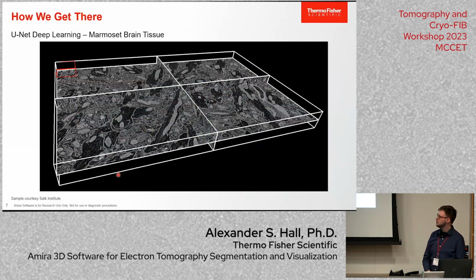So the traditional methods of thresholding or isolating the phases according to their intensity range, that wouldn't really capture much of anything here. And Cryo-ET data is very, very similar. So where the field is moving right now and where Amira is going is to lean heavily on the concept of machine learning. So machine learning is a very large catch-all term. It applies to many, many things.